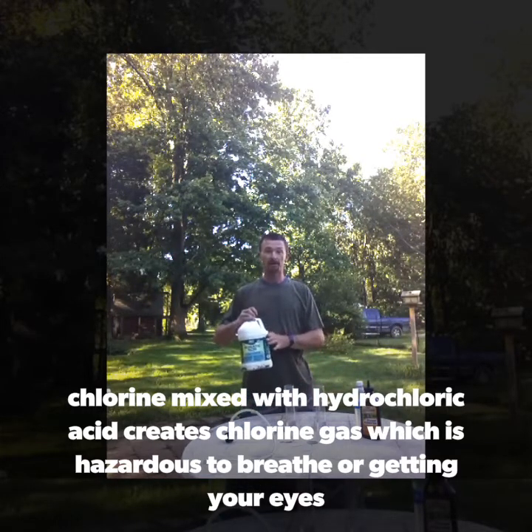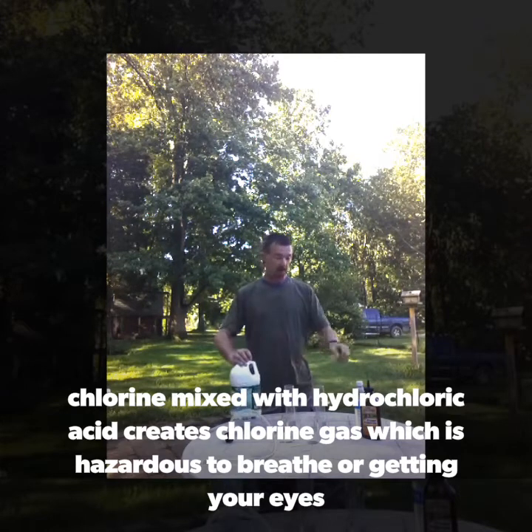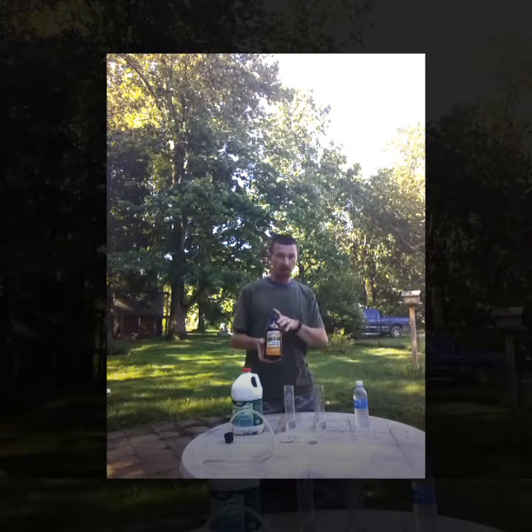You're going to need muriatic acid, which is hydrochloric acid — available at any Lowe's, Home Depot, or local mom-and-pop hardware stores. Then you're going to need potassium nitrate. I prefer to use Spectricide stump remover, once again from the hardware store. Read the label and make sure you know what you're buying, because some products have different ingredients. That's why I like the Spectricide — I know it's potassium nitrate.